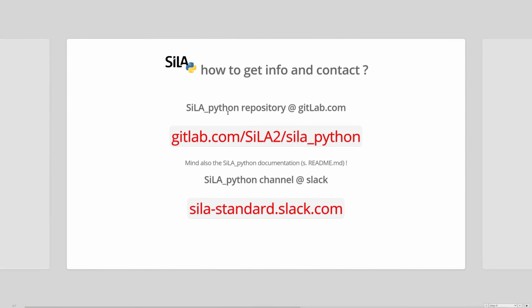To get more inspiration for features, for design of servers, and also to use the SiLA code generator, just look at our SiLA Python repository. There's also documentation.